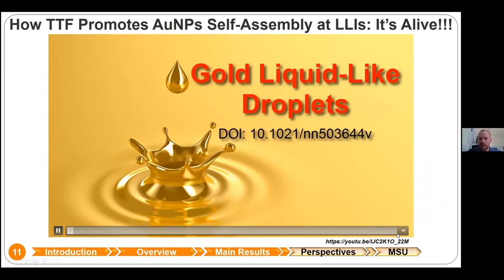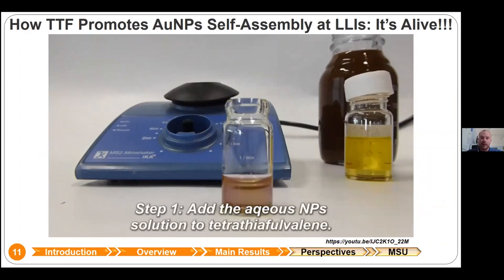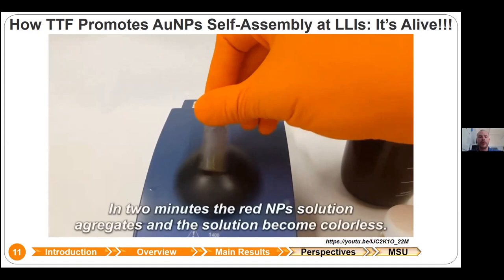A small video describing how it works in reality. So I used this yellow liquid, which is DCE with a TTF. The red solution is gold nanoparticles. So we shake them rigorously for 1-2 minutes.